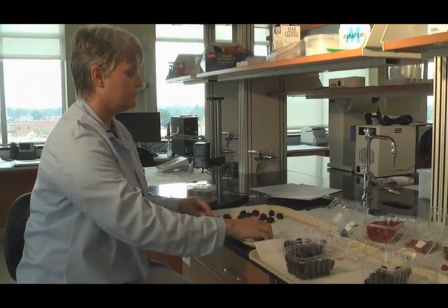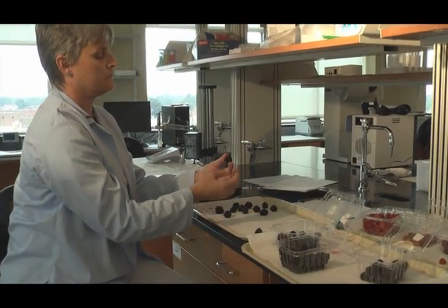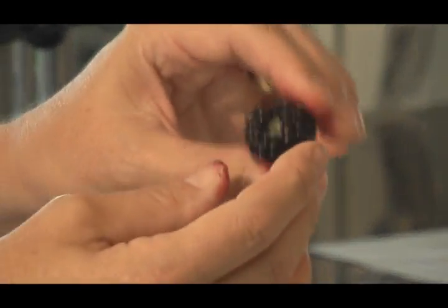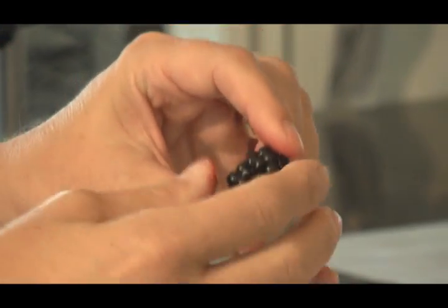The last step is to go through these and look for decay. I pick up every one out of the rows and turn it over very carefully, looking for any kind of visible mold or decay. Usually in blackberries, you're going to see it at the calyx end — down here where it attached to the stem or the pedestal.